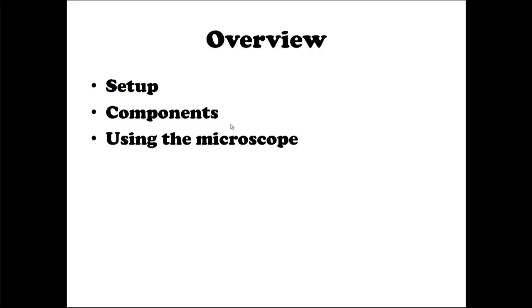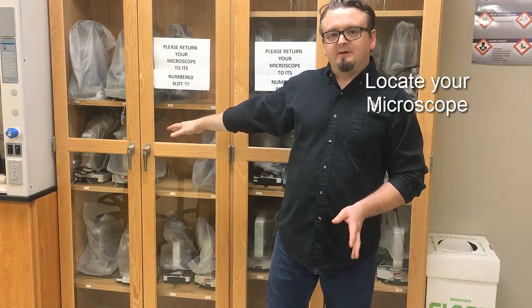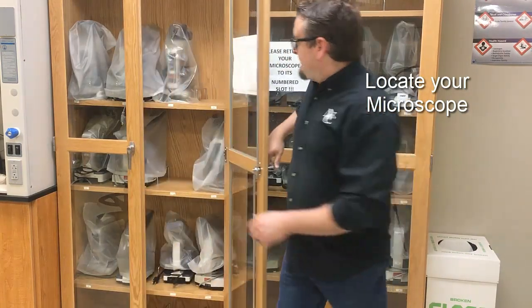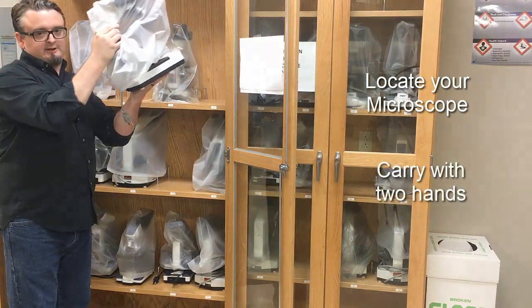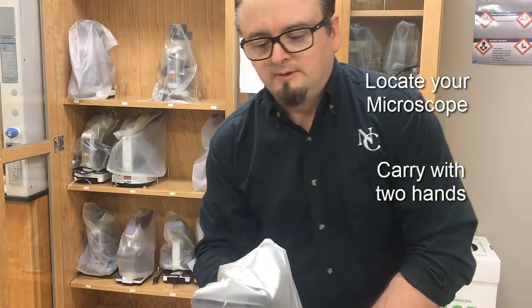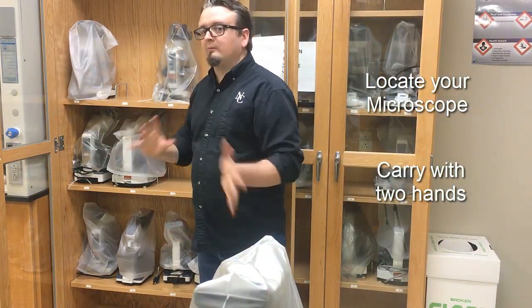Let's start with the setup, beginning with how to get the microscope out of the designated cabinets. You can see all our microscopes located here behind me. We can open the door by turning the handle to the right. Grabbing a microscope is as easy as taking it first with one hand by the handle, putting another hand underneath the base, and carrying it with two hands. Make sure you've got the assigned number you were given and that it matches with the cabinet.